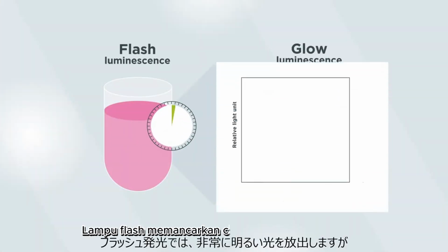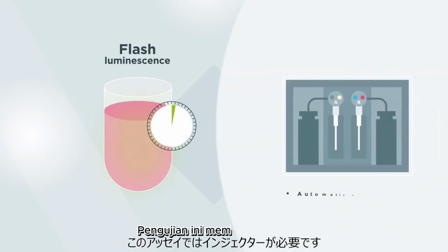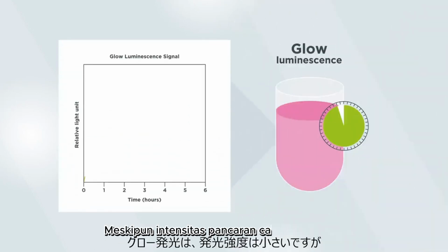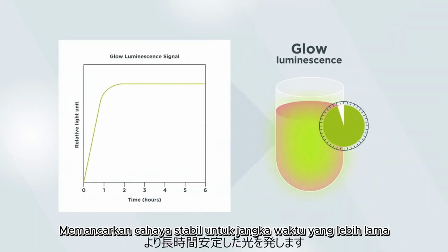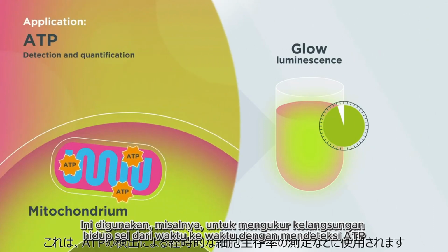A flash reaction gives a very bright signal, but as it lasts for just a few seconds, it requires an automatic dispenser and injectors. A glow reaction emits a less intense but more stable signal, which can be measured for up to several hours. It is often used for ATP detection and quantification.